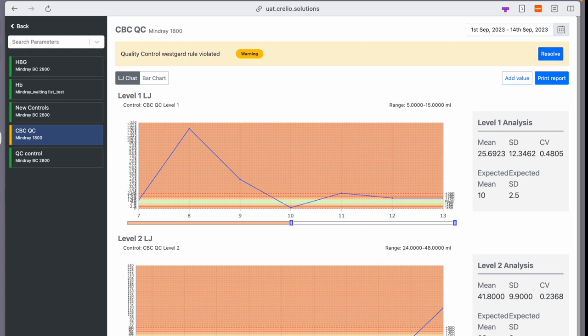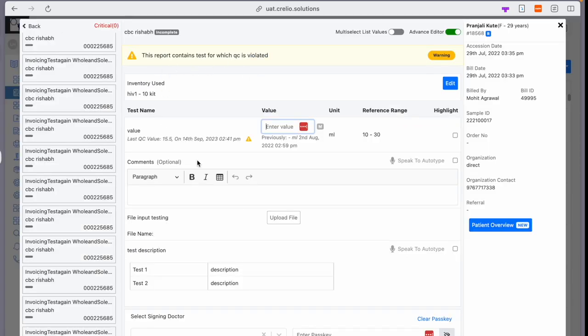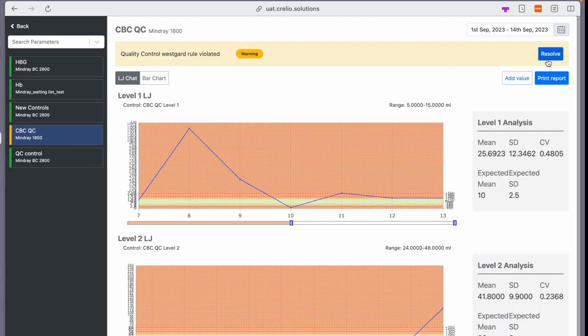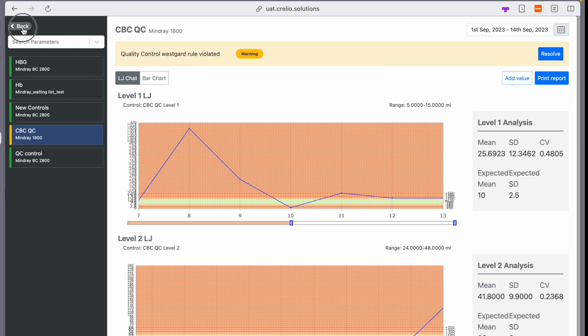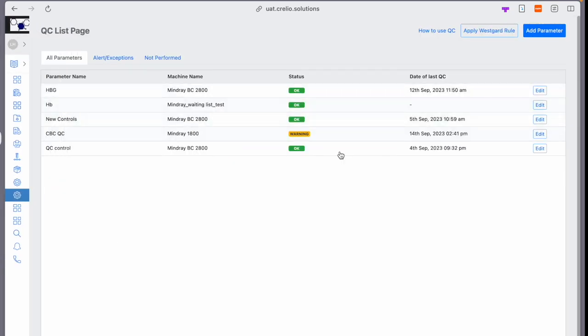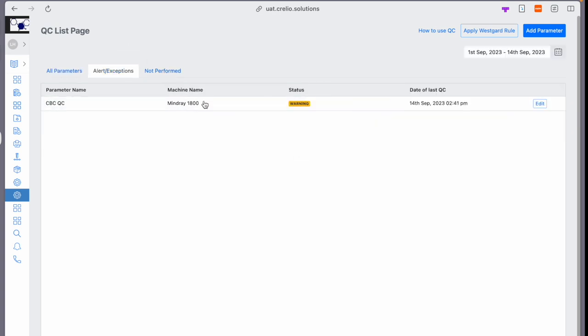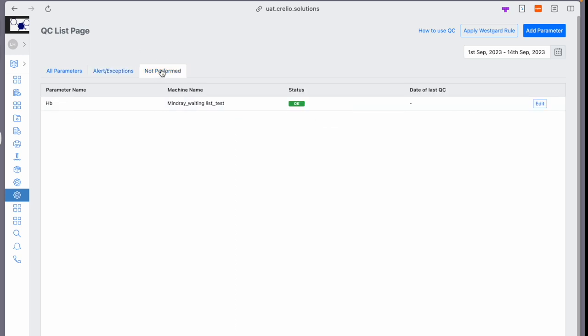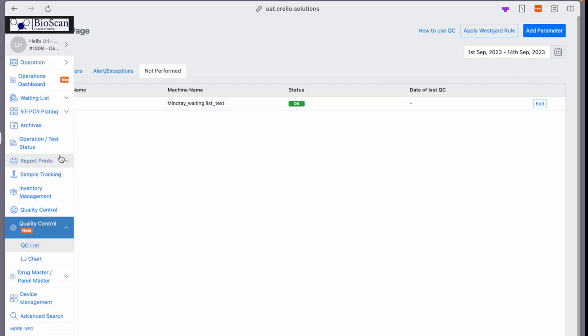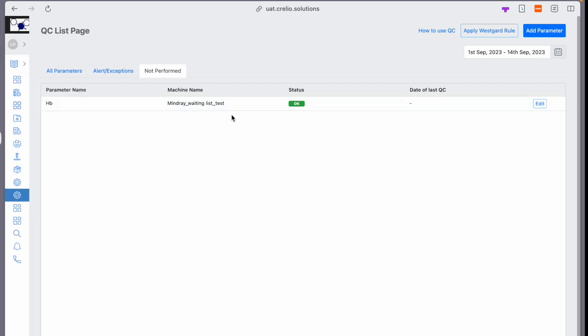Also, I see that for this QC there is a violation. If you want to resolve, you can go back to the QC section. Now before that, you see that this shows a warning even in the QC page. And on the alert exception page, you can see that these QCs have the warning status over here. The QCs which are not performed in this time period will show up here, so you know at all times which QCs are not performed during this time period.